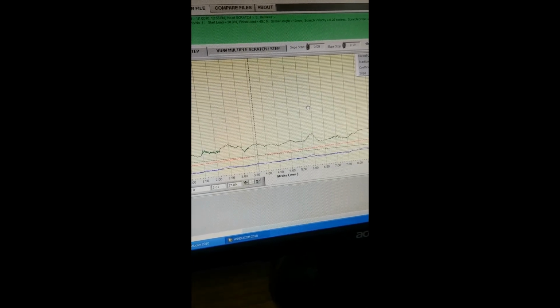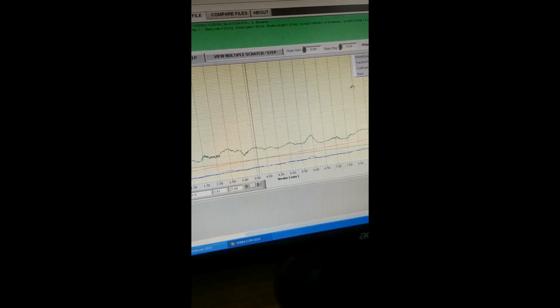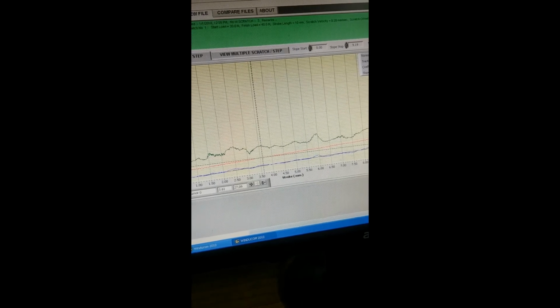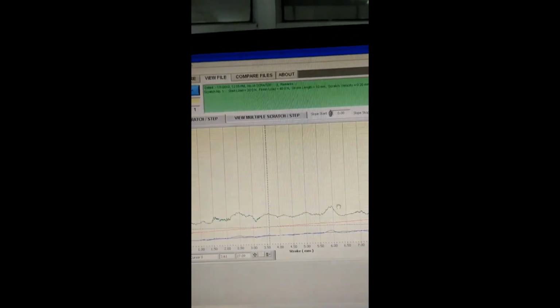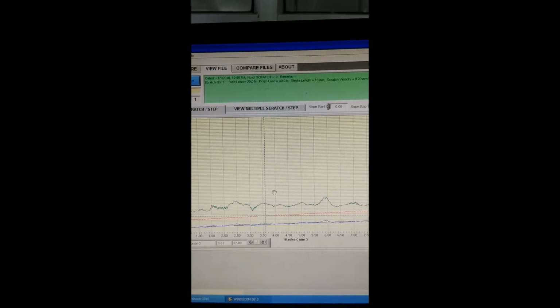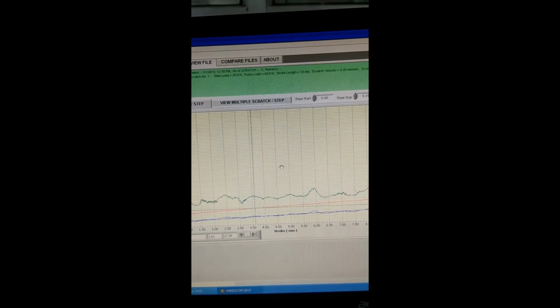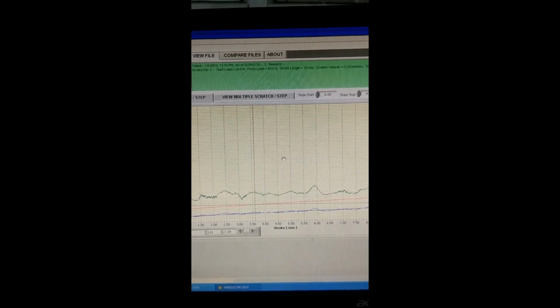Through this we can know the coefficient of friction, the tractional force and the normal load. We'll generate such data, graphical data or numerical data, and finally we'll send it to you, and you have to plot the graphs and submit.